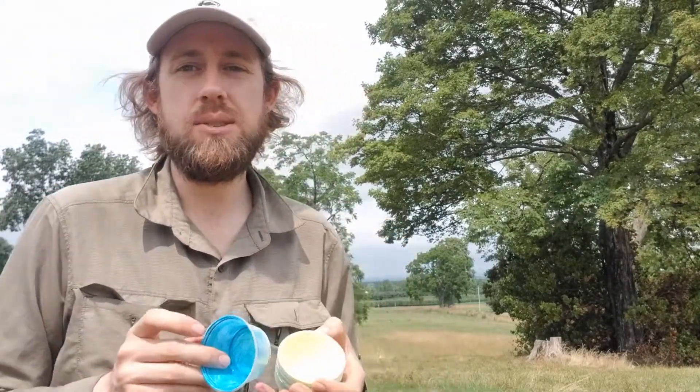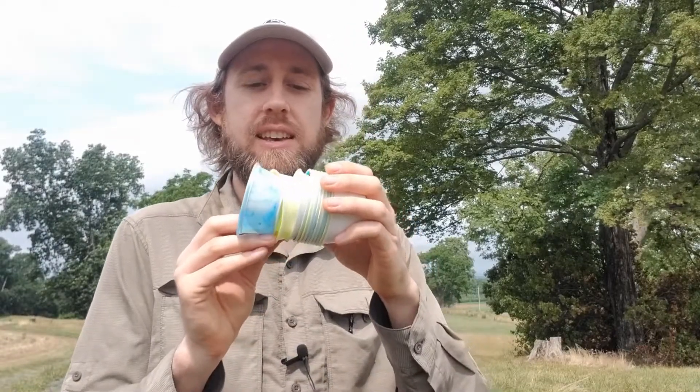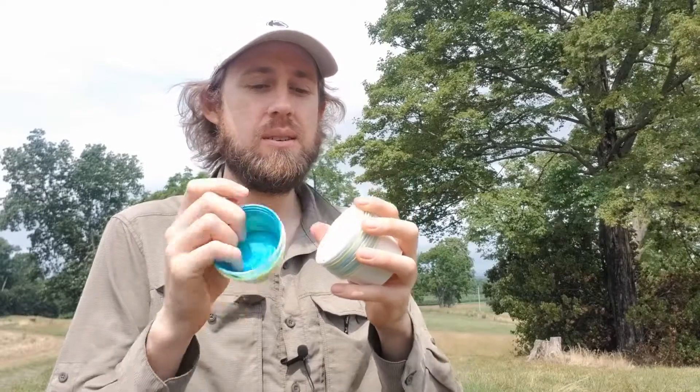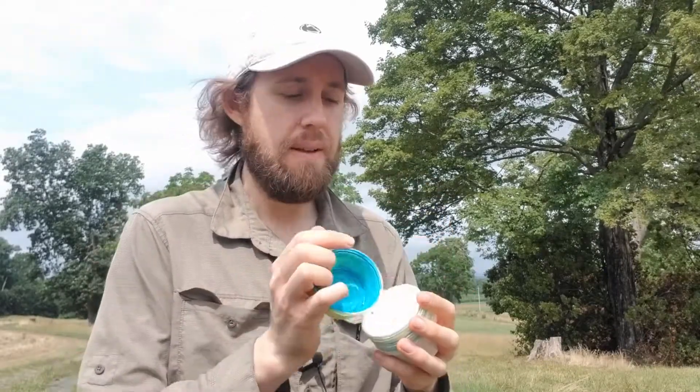One tip: before going out to put the traps, arrange them in a repeating sequence. Here I have blue, yellow, white, and then blue, yellow, white over and over. The exact order is not super important, but you want to have it in a repeating cycle so that you don't have two blue traps or two yellow traps right next to each other.